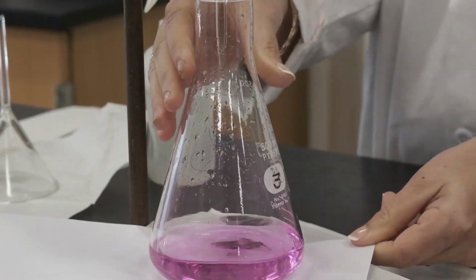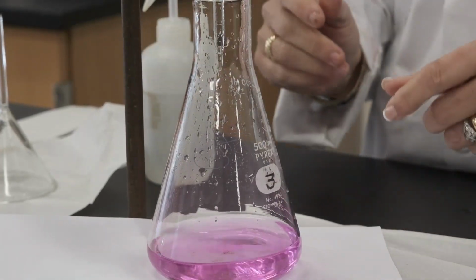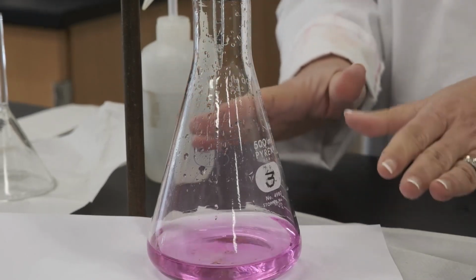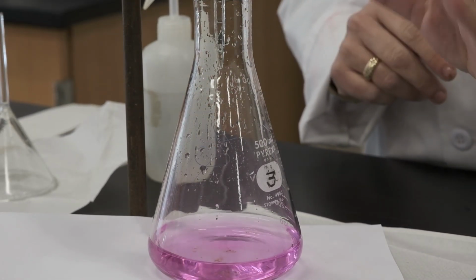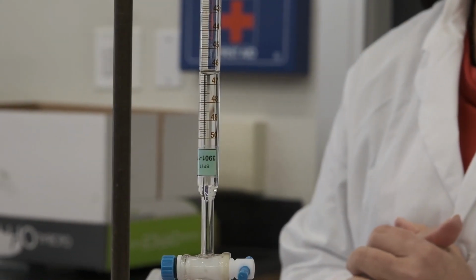So here is too pink. You need to go a little lighter, but this is a good titration still. Okay, so record the values and then you're done with the first three titrations.